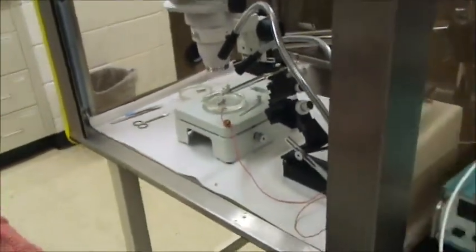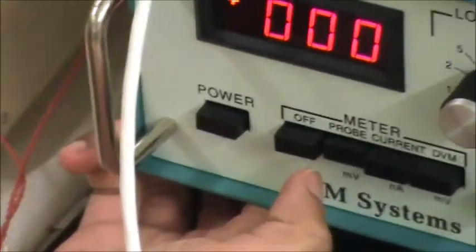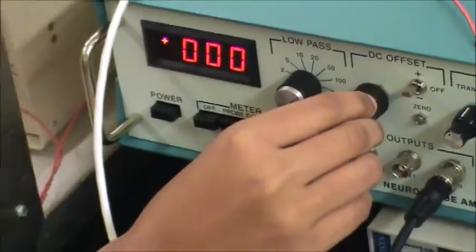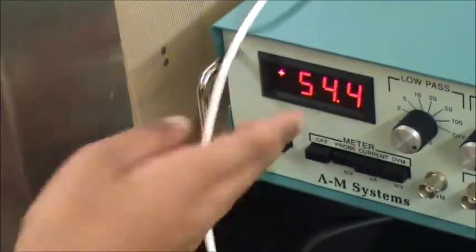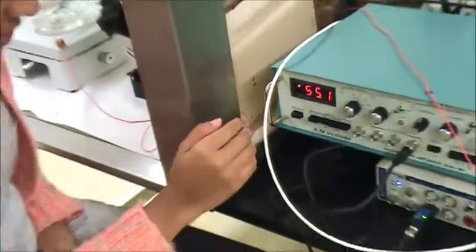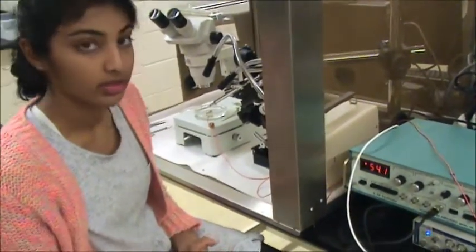So now we're going to go over here to the amplifier. We're going to turn it on, and we're going to press the probe. And if it's not already at 0, you're going to want to fiddle around with this DC offset to make it 0. And now we're going to press the electrode test. This is perfect. You want it to be around 20 to 60 megohms. So this fits in that range, so it has a good enough resistance to continue the experiment.